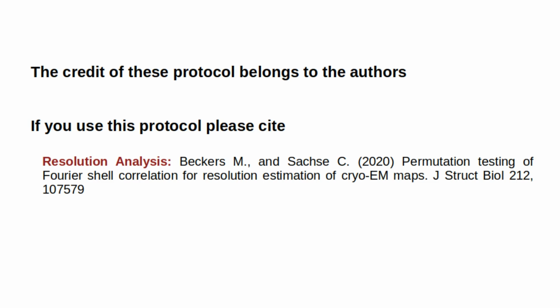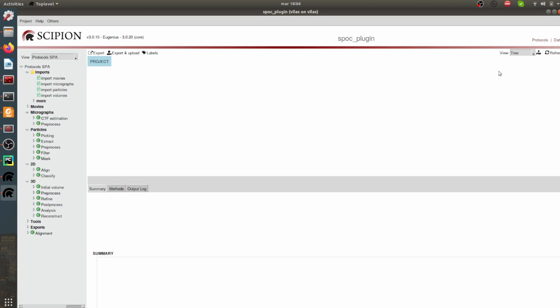The Fourier shell correlation, or FSC, is the standard resolution metric in cryo-EM. However, the resolution determination step is still subjective and not fully automated. This is because it involves a series of map interventions before the FSC estimation. Also, the proper threshold of the FSC has been subject of discussion for many years.